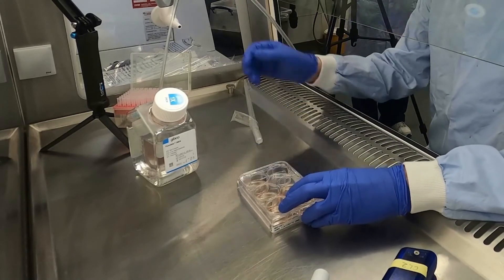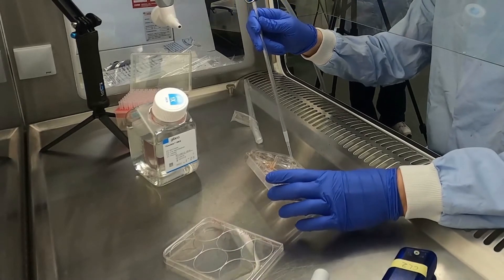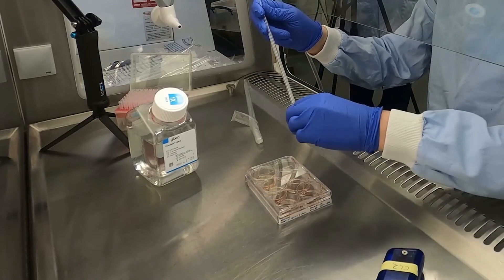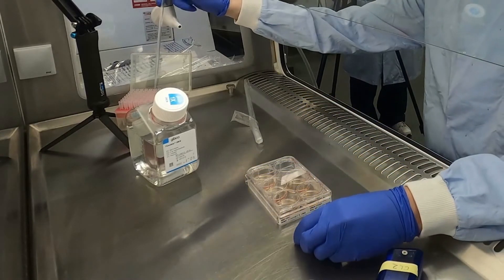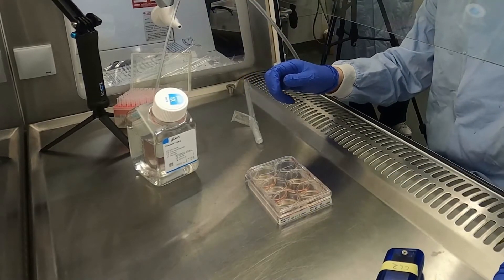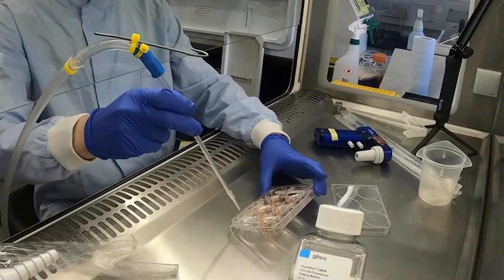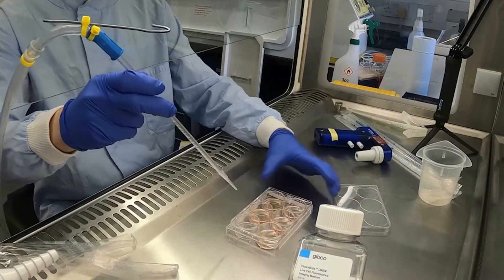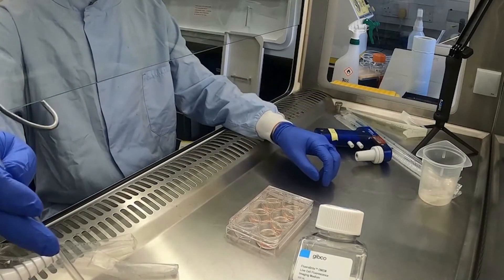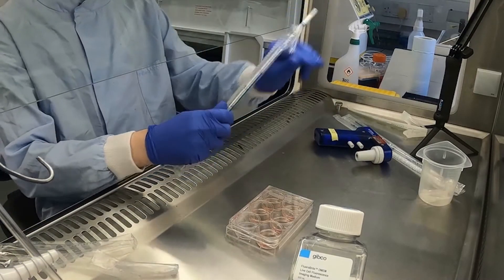Agitate the plate, then aspirate the DMEM and repeat this wash step twice. Aspirate off the final wash then add 2ml of FluoroBrite DMEM. The cells are now ready to be observed using a fluorescent microscope. This should ideally be done within 30 minutes to ensure optimal fluorescence.